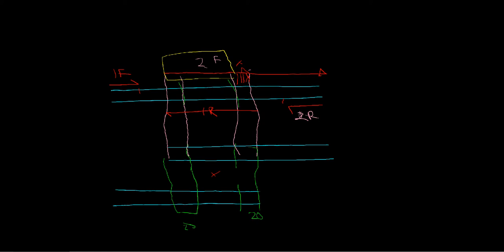And let's break down that back part. The back part has another 20 base pairs of homology, and it has this center part. And the center part is where we're going to be adding Ns. So we'll just put a bunch of Ns there. So 4 Ns.